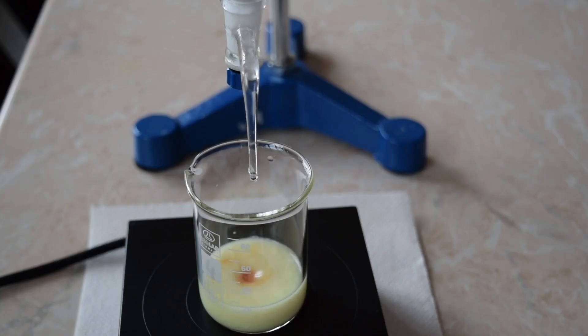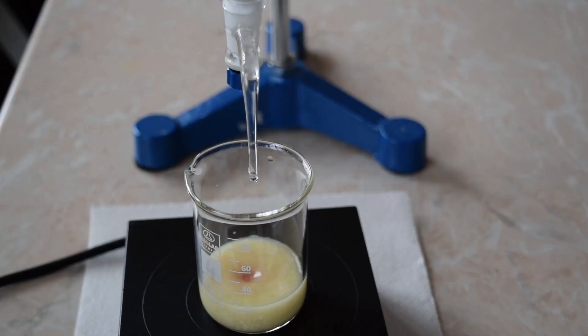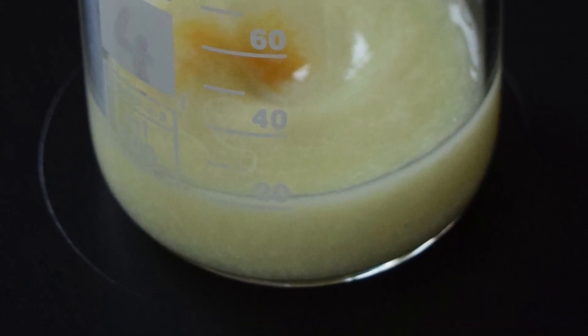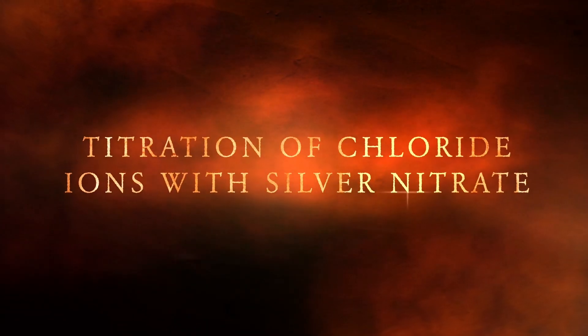Chloride-containing solutions can be analyzed via titration with silver nitrate using chromate ions as indicators for the endpoint of titration. Titration of N-chloride with silver nitrate.